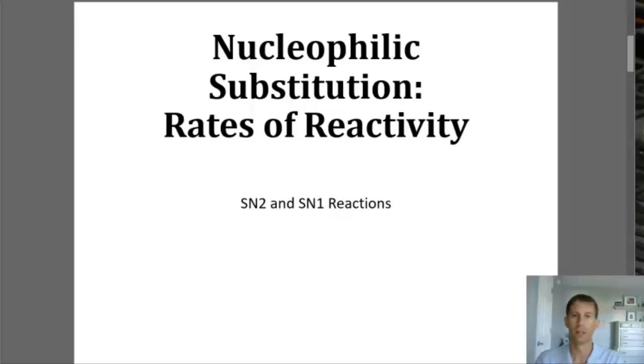Hello everyone, welcome to the experiment, Nucleophilic Substitution Reaction, Rates of Reactivities. We are going to look at SN2 and SN1 reactions for a list of 7 substrates.